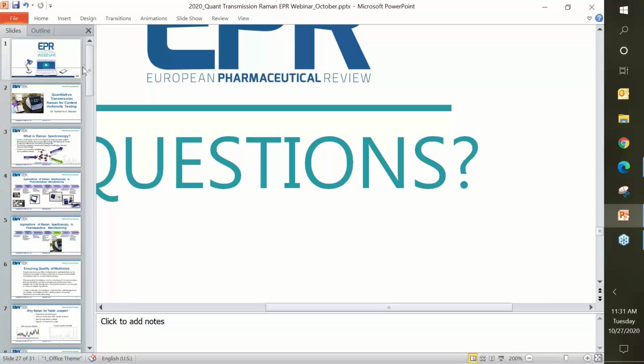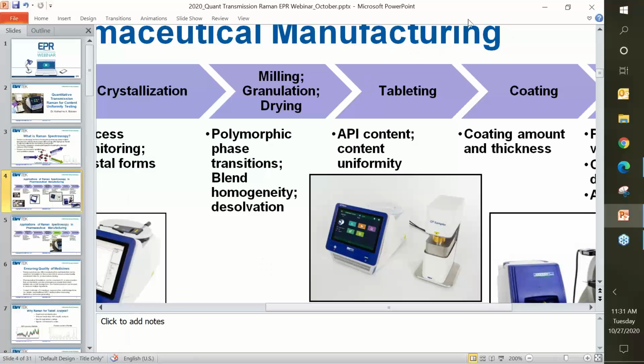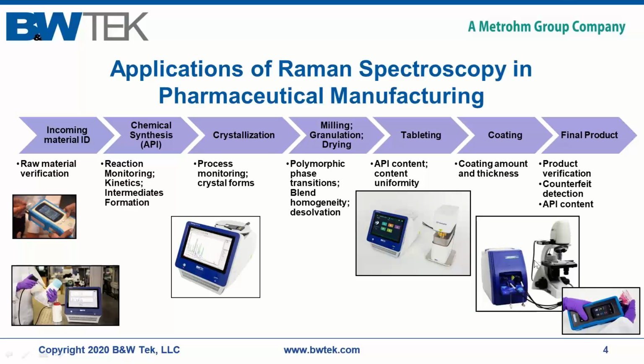liquids could be measured. So if you'll recall here, I've shown a couple of different instruments, and let me get back to a good view here. So in all of these cases, these are fiber optically coupled instruments. And here I have it coupled to a microscope.